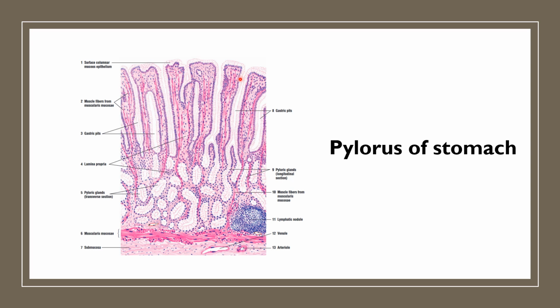So now this is your epithelium. This entire part is lamina propria. Now this is your muscularis mucosa. So that means this is your mucosa. Next, submucosa, the same thing as I told already. You will be having moderately dense connective tissue with blood vessels, nerve plexus. The nerve plexus I already told, submucosal nerve plexus. You will be having blood vessels, lymphocytes, elastic fibers and collagen fibers.